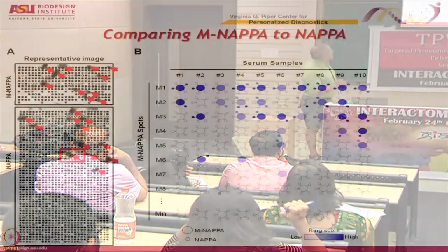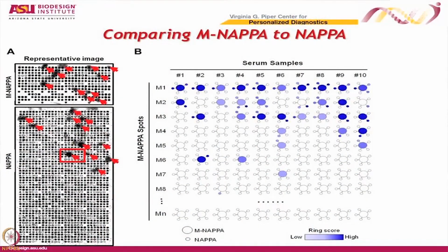Yeah. All right. So I think here you can see that would be like a 5, that ring right there, whereas this one probably would be a 1 or a 2. So there you can see the spot there. You can see a little bit of the ring right there. This one is like, that's a 5. It's spilling all over. You know, this might be a 3 up here, that sort of thing. So you get used to it after you do a lot of these.